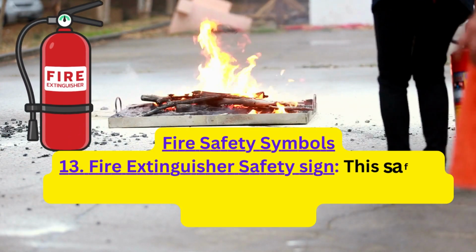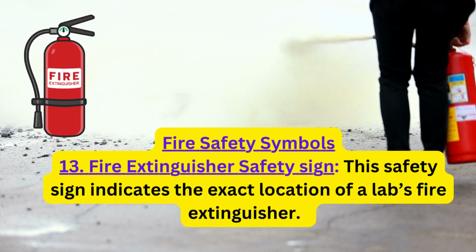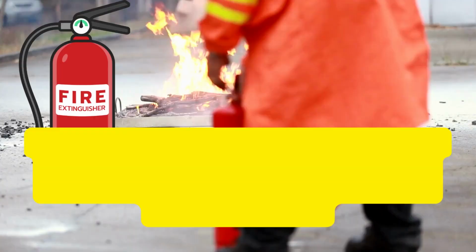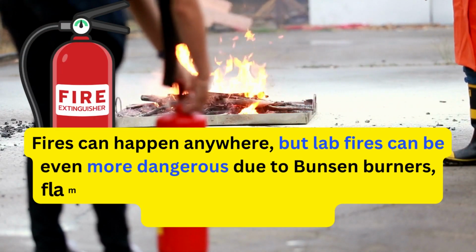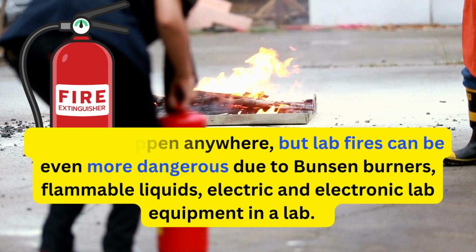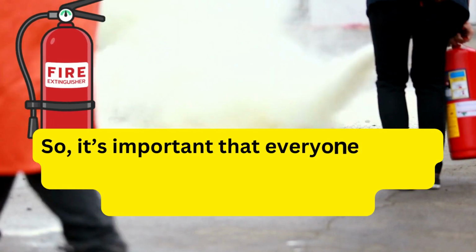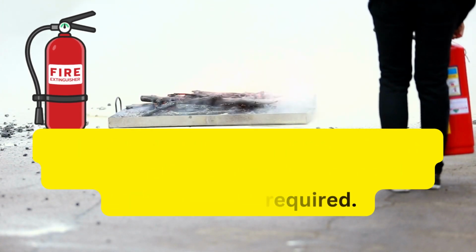13. Fire extinguisher safety sign. This safety sign indicates the exact location of a lab's fire extinguisher. Fires can happen anywhere, but lab fires can be even more dangerous due to Bunsen burners, flammable liquids, and electric and electronic lab equipment in a lab. So, it's important that everyone in a lab knows how to use the correct fire extinguisher as required. 14. Fire blanket sign.